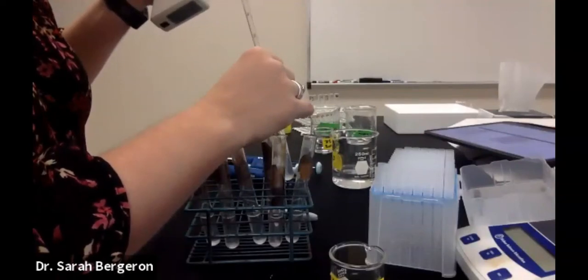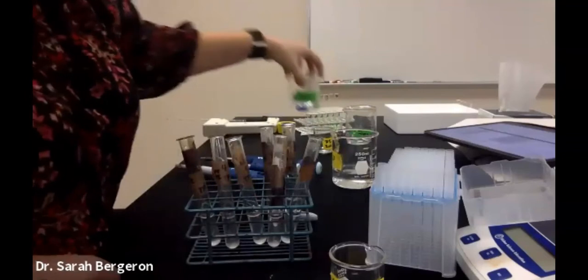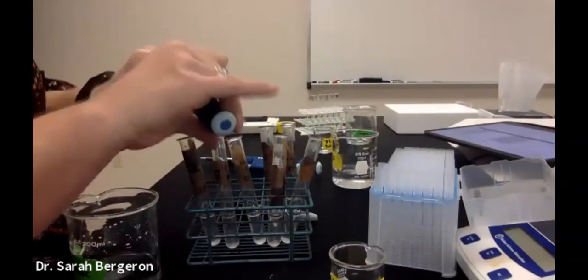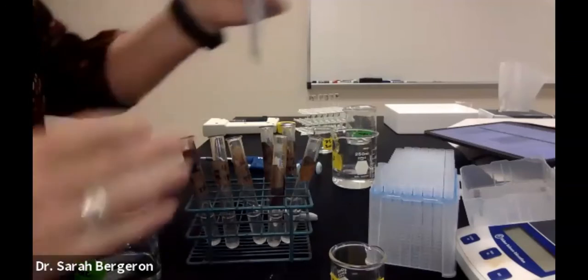3.3 of water. Okay, so we have water in all of them. So now what we need is our ascorbic acid and our ammonium molybdate. So we're going to go ahead and add that. So we need 500 microliters of each.